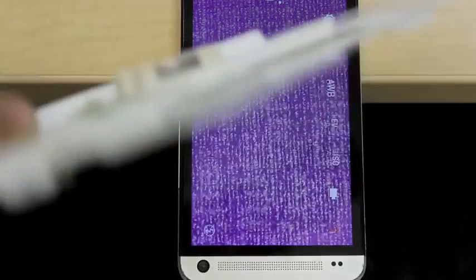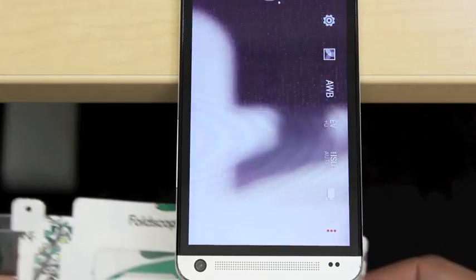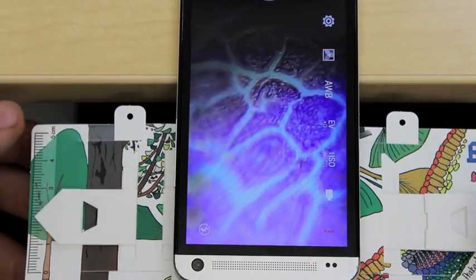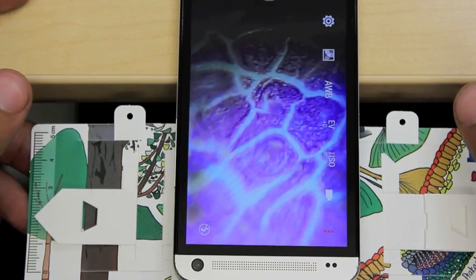Now that we've attached the magnetic strips to both our phone and the foldscope, we can begin to take pictures with our phone using the foldscope. I went ahead and attached the light module, which is necessary for taking images using your phone. First, let's turn it on — you can see that it's on because it's shining a light. I've suspended my phone off the table and taped it so that it wouldn't fall, which makes it much easier to take images. Both of the couplers should be aligned, so all we have to do is place our foldscope near the phone and it should snap into place. And as you can see, we can see our sample now.